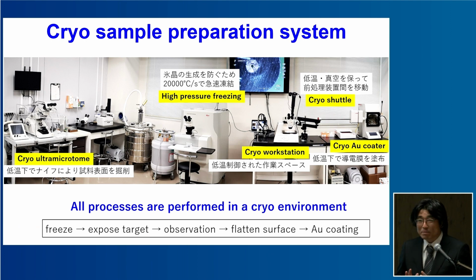This is the sample preparation system. All processes are performed under cryo conditions. Professor Kudo helped me to complete this system. Thank you very much.